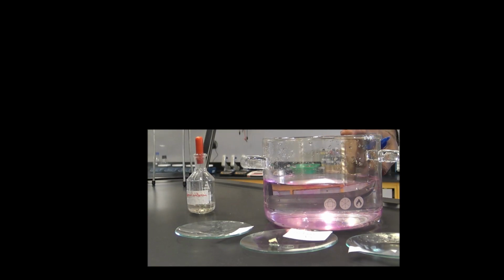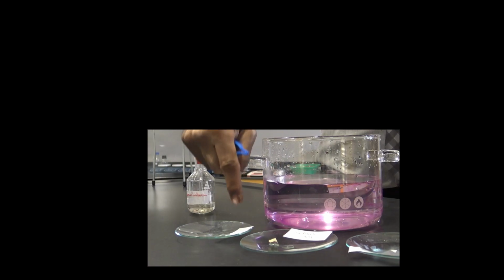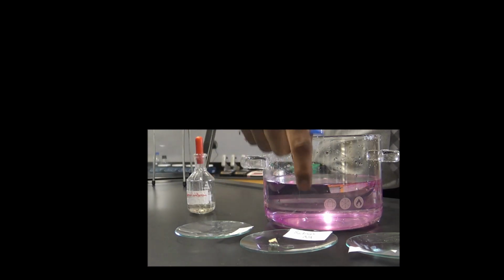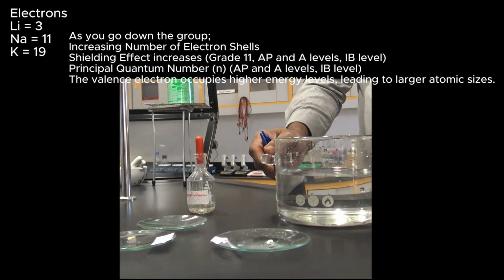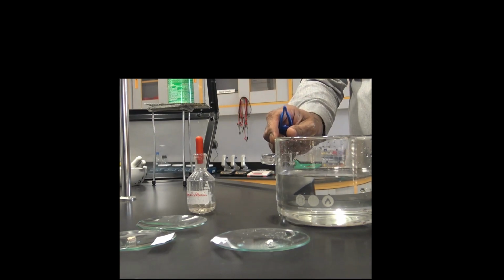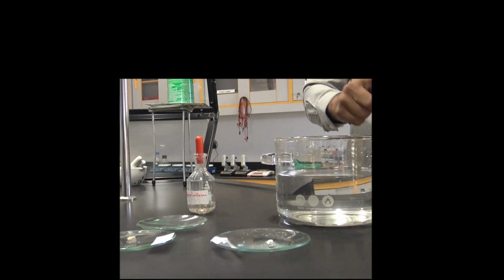We have sodium, and you can see it quickly dissolves, completely gone. One thing we need to understand is that the size of sodium in the periodic table is bigger than lithium. Lithium contains 3 electrons, while sodium has 11 electrons, and so on. Alright guys, now the third one is left, which is potassium, which comes after lithium and sodium. I think it is much more reactive than lithium and sodium.